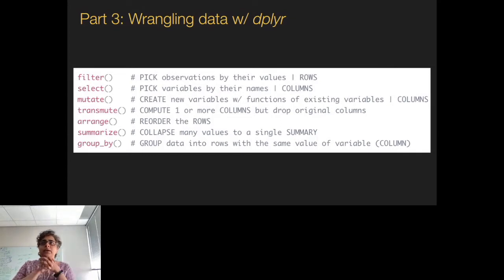All right. So next we are going to look at an extremely powerful package called dplyr. It was built based on Plyr. And it's very, very helpful for basic data wrangling. So you've already looked at select, which we use to subset different columns. You can use so many functions within select to exactly identify which columns you want to subset and how.